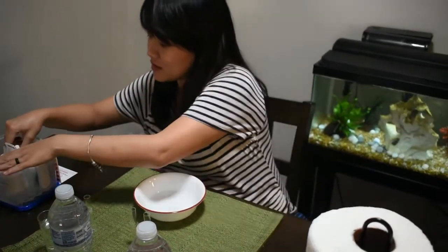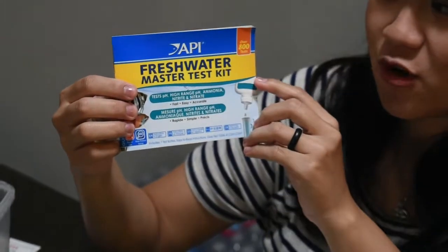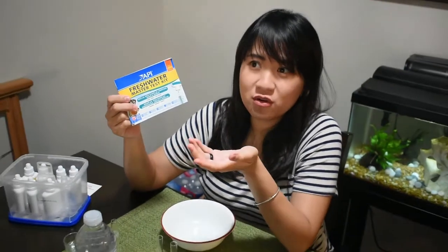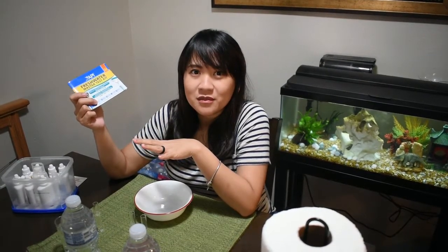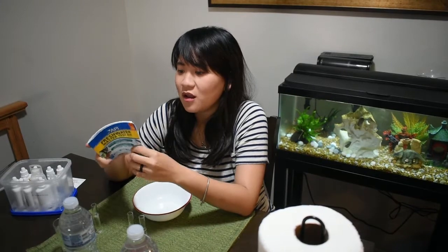The testing kit I got is the Freshwater Master Test Kit from API. You can get this testing kit from your local store, a fish store, and it's really easy to get. There is also testing paper, like a pregnancy test, the paper one, but it's not really valid. I did research about that, but I'm not sure. Some people still use that and it still works for them, but I like this one because it's the best for me, and it's really valid.